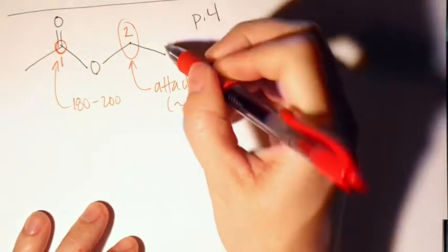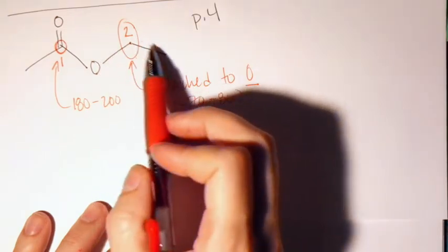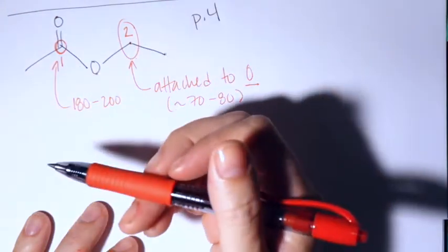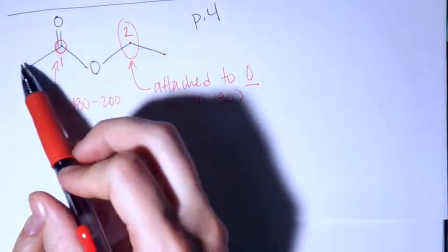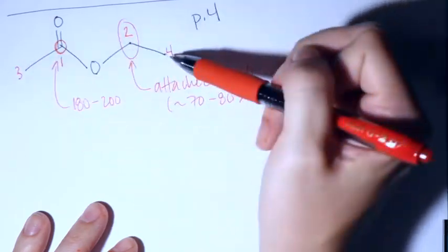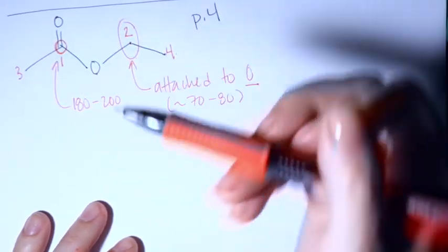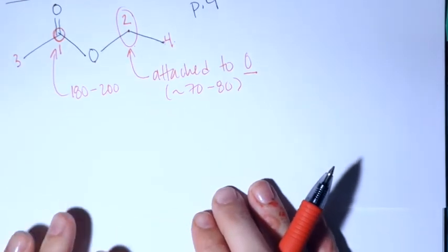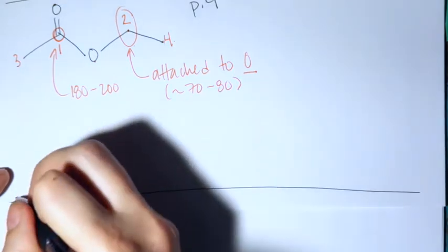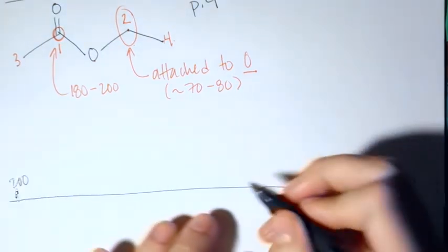And then we have these other 2. This one's beta to the oxygen, and this one's next to a double bond. Those are getting close to some deshielding effects, but they're just regular alkyl carbons, so they're going to be in the alkyl region, very upfield in the spectrum. Relative to each other, it would be hard to predict their placement. One of these would be peak 3 and one would be peak 4, but it would be really hard to predict, so you could assign them either way. So anyway, if we start piecing together the spectrum, again, 200, 0.